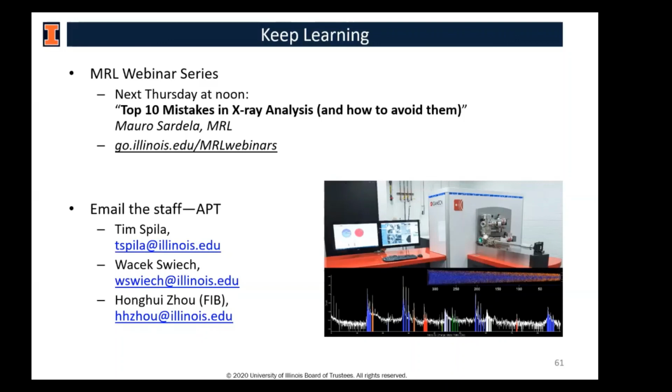Everything is on the detector. So you don't have what could be a problem with the contamination, and typically is related to the method of making these emitters by focused ion beams. Correct. So then you typically use some gallium for cutting these small slabs and so on, and also sharpening the tip. So in very many cases, you have some amount of gallium at the beginning of the process, namely on the very apex of the tip.